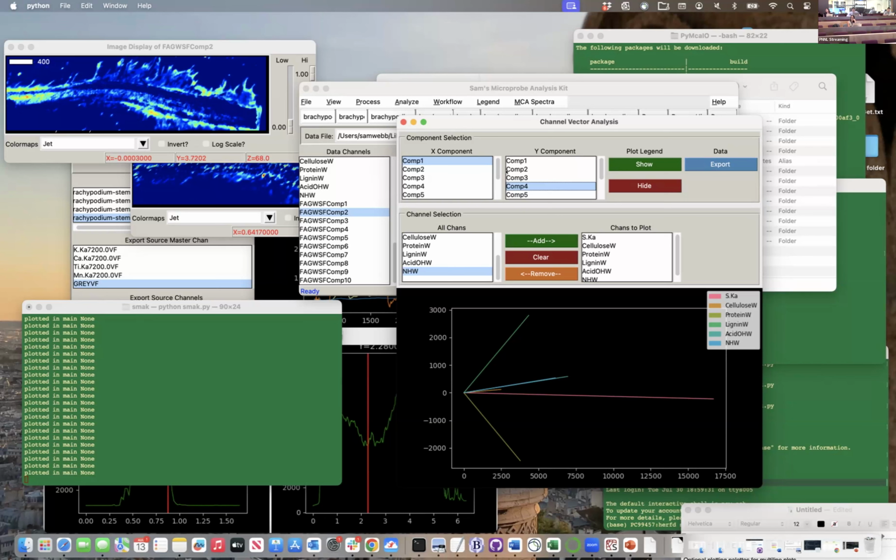Yeah. And this boils down to my root idea that a bright field optical image is a really key thing. So you really want a really good bright field image that represents the data as it was collected, in the exact same region that you collected. So you can easily see how your data relates to the bright field, and how the bright field of method A relates to method B.